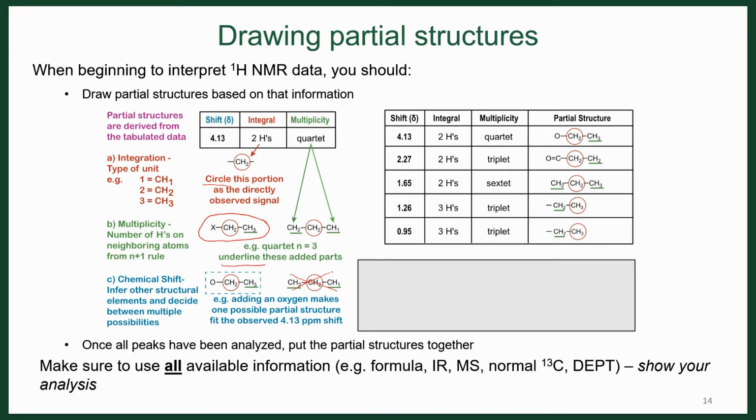All right, so we could say, well, it looks like this partial structure here could overlap with this partial structure here, because this CH3 group could be this CH3 group that we're inferring its existence through this green underline. And this CH2 group that we're inferring could be the same CH2 group that we see there.